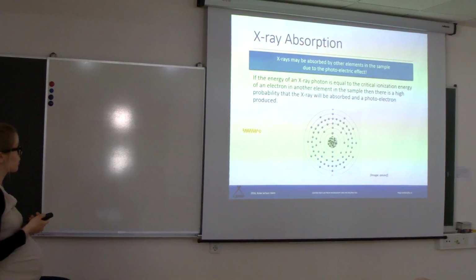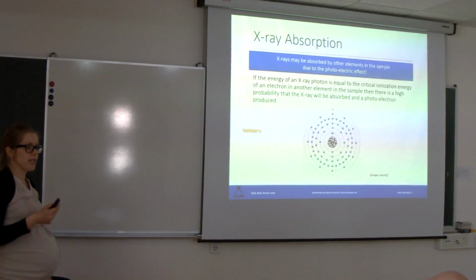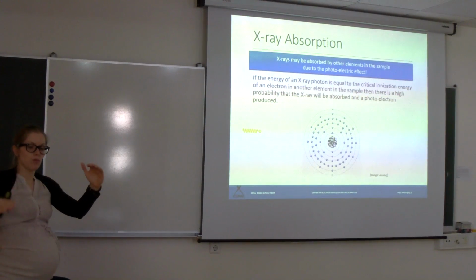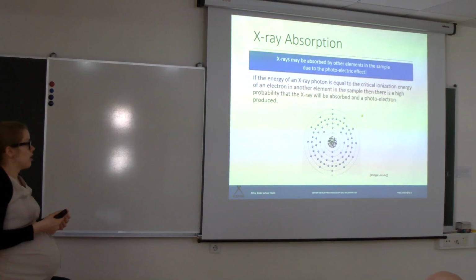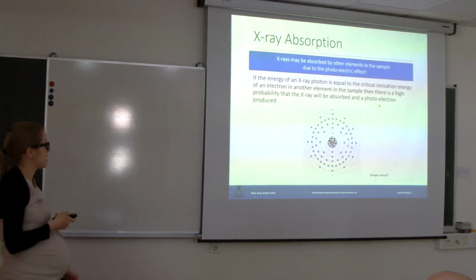X-ray absorption. This means that the X-ray that is generated somewhere in the sample, when it's coming out of the sample, can be absorbed in the matrix of your sample. So this influences what you then detect on the EDS.